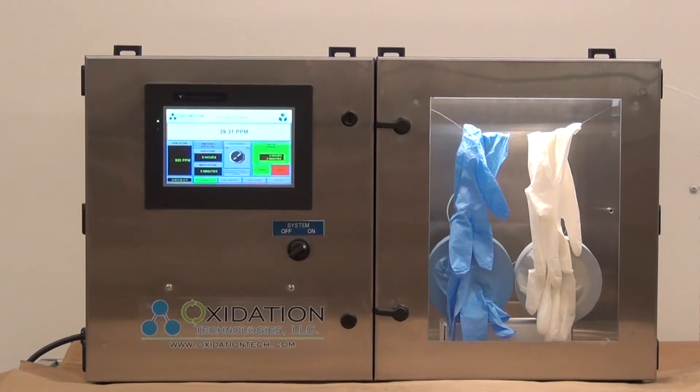The ozone chambers we offer can be used for accelerated material age testing, scientific research, odor removal, and more.